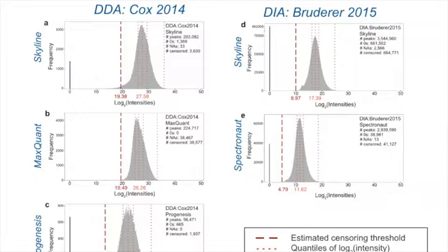Well, again, first of all, we don't do imputation, not like that. I haven't told you yet what we do. But essentially, we distinguish two situations: when something is below the limit of detection, and when something is missing at random because we just cannot get the number. If something is missing at random, we will not touch it. We will leave it NA. The problem is that for many tools, there is no such distinction. So if we cannot get to this distinction from the data set, then we will assume that it's censored and work with it as if it's low abundance. If it's missing at random, we will never ever do anything with that. We only do something if it's censored.